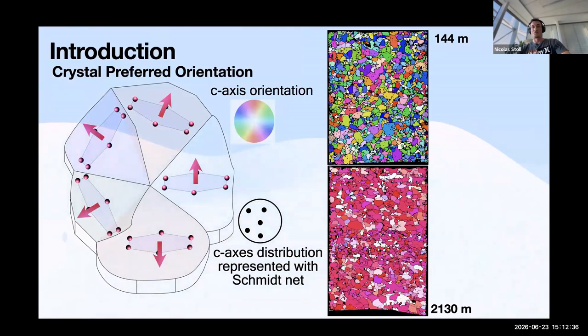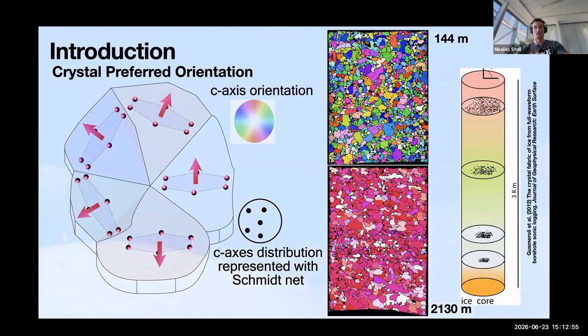And if you look into your ice core, you can actually see this. The upper example is very shallow, a few hundred meters, and the deeper one is from below 2000 meters. And you can see the change in color, which we can really see with our eyes. And the more the colors are the same, the more similarly the grains are orientated, and they align with depth usually.